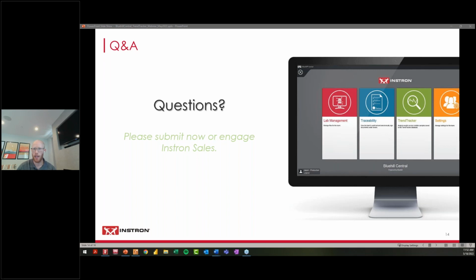Okay, now live. Those were some of the registration questions. Now I'm going to look at some of the live questions. All right, first one: what equipment? So that's a good question. Can we connect TrendTracker to other equipment besides the Instron to get the data all associated to that sample?